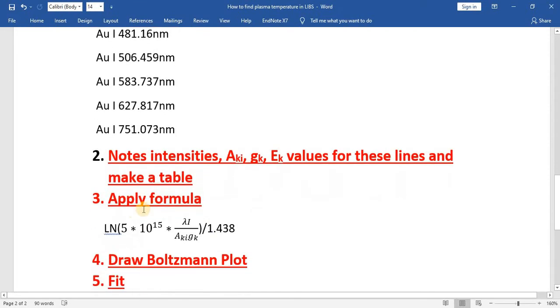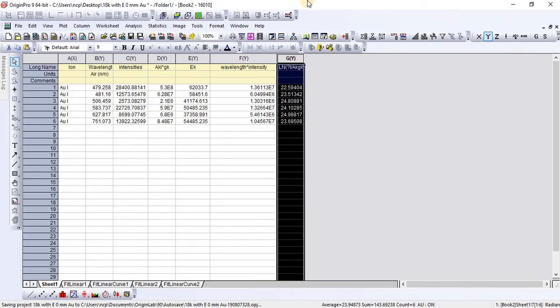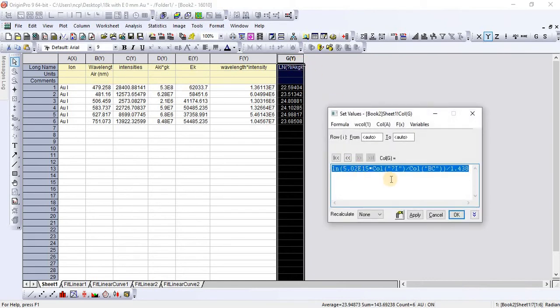The next step is to apply the Boltzmann formula: the natural log of 5 multiplied by 10 raised to the power 15, multiplied by lambda I, divided by AKGK, whole divided by 1.438. To apply this, select the column, then press Control+Q. I have already applied the formula.